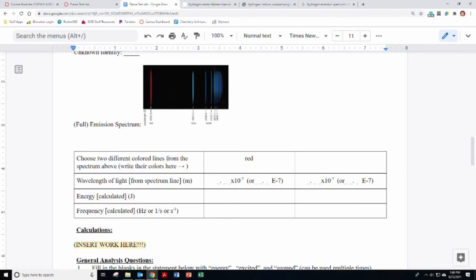We just need those numbers. We're going to change the form of those numbers. You're just going to take the first three digits. So for me, that would be 656. And you're going to replace in either form of this number.